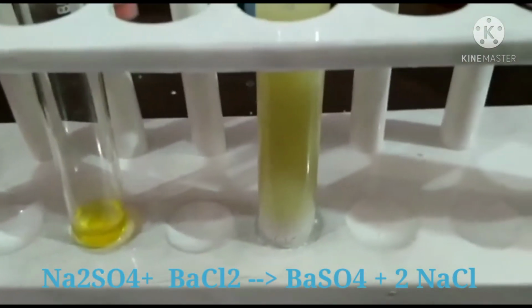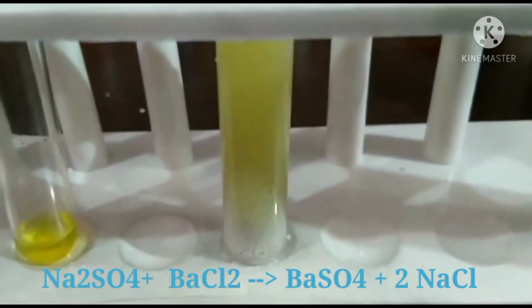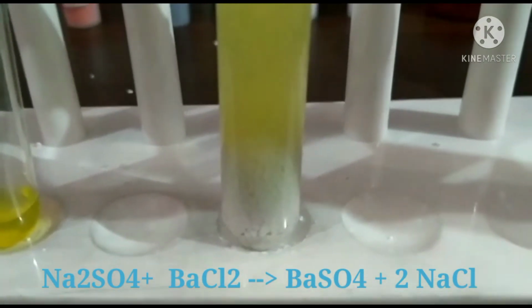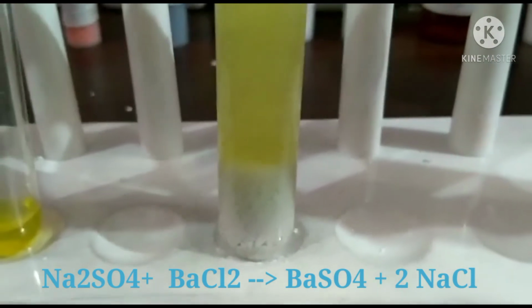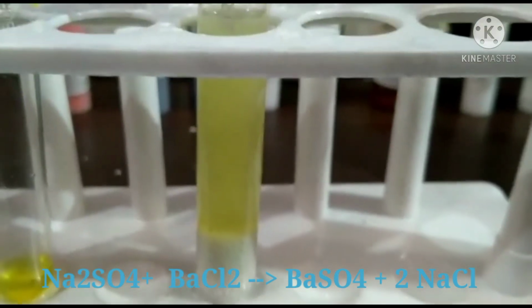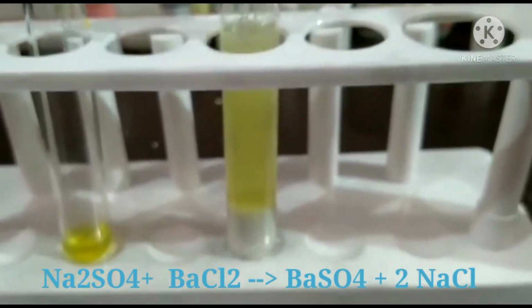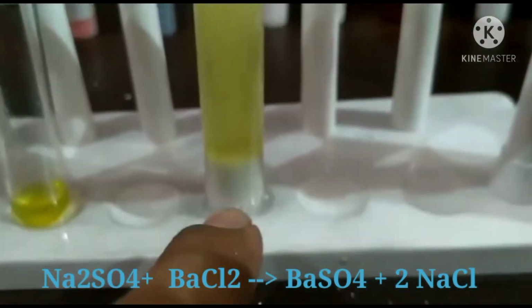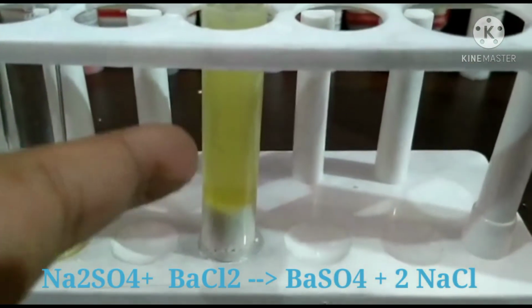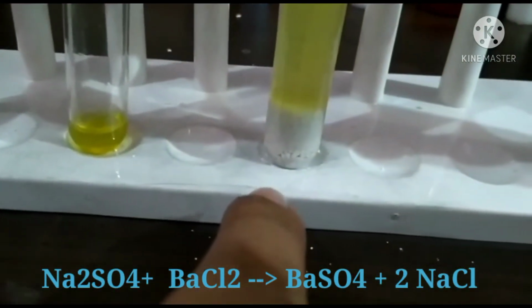Now after some time we will observe the formation of a white PPT at the bottom. You can clearly see that the white PPT is forming near the bottom of the test tube. Basically, a precipitate is generally an insoluble solid that forms near the bottom of a test tube and separates from the solution. You can clearly see that the white PPT is formed below, and a solution is formed above it. The white PPT formed here is barium sulfate.